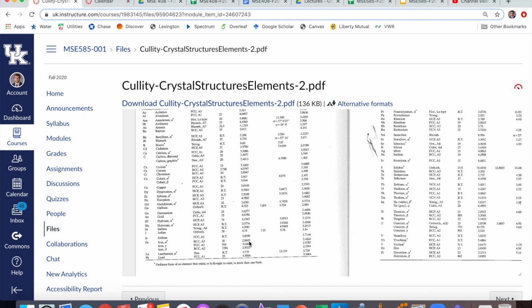In real life, you won't always have an exact match like that. But as you might have been able to tell, I made this pattern based on this lattice parameter. So if we look over, this is BCC. We know it's the right lattice parameter. This is alpha. This is iron, and it's alpha, which is the room temperature phase of iron, which is in some cases called ferrite. And so that would indicate that our material is alpha iron, which is also ferrite, and that's our best match.